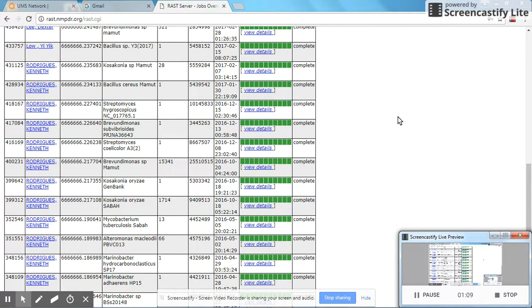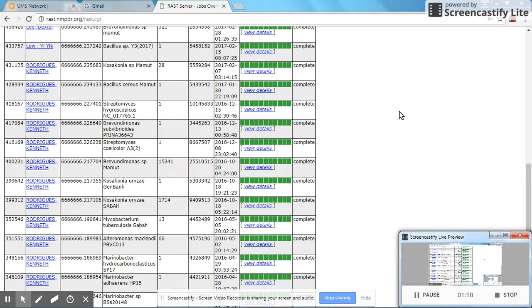Generally, RAST requires around a day to maybe a few hours to complete a single genome annotation. It depends on the server speed as well as the number of jobs which are currently in the queue.